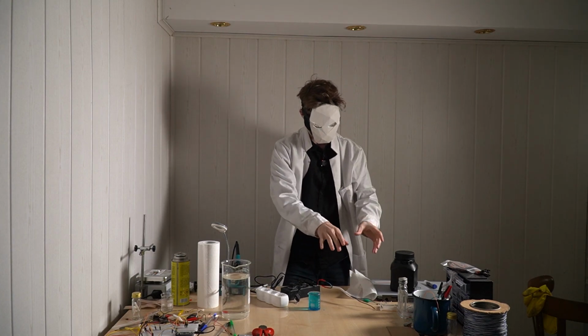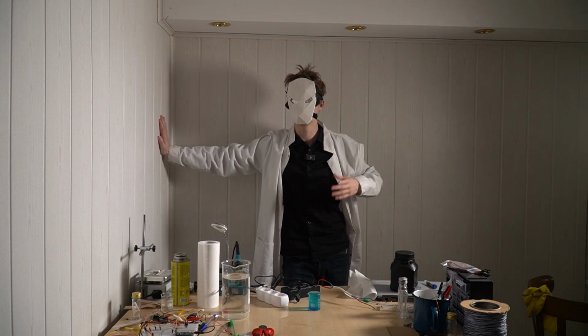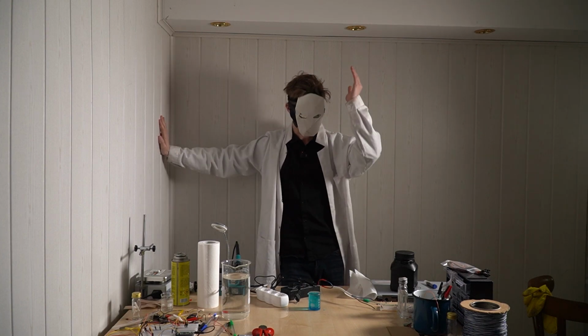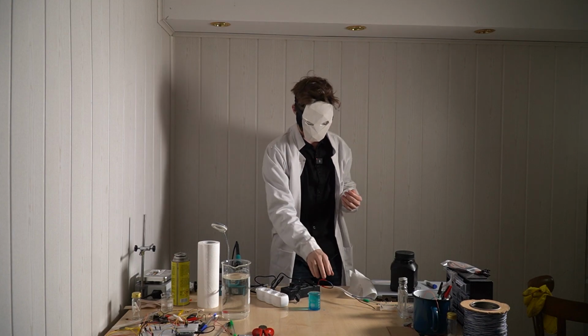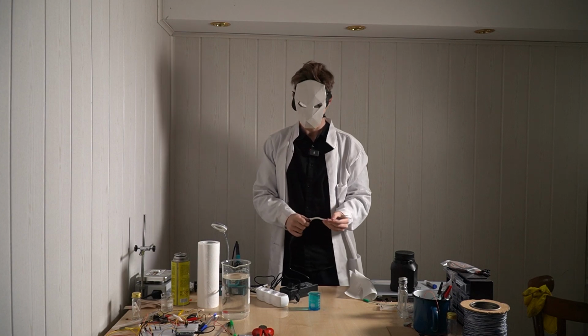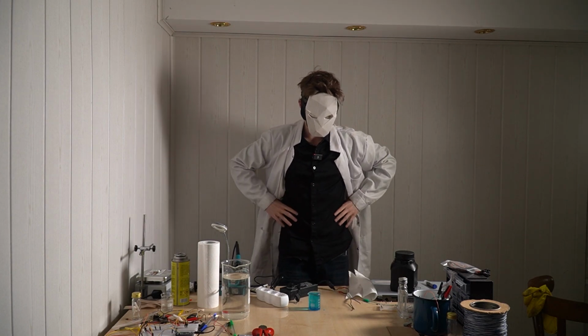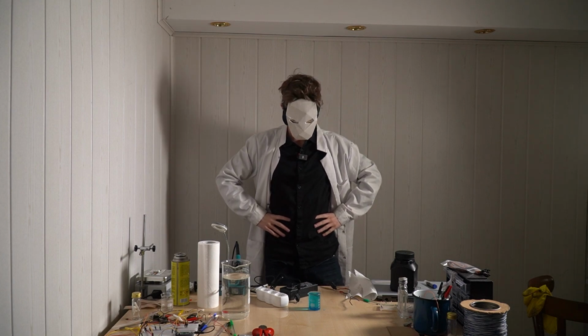There was like a weird thing forming on the cable too. What did I do wrong? I mean, I dropped some copper sulfate into water, and then I submerged two cables with electricity in them, and it should have worked, right? I mean, we did electrolysis. So what's wrong? This doesn't make any sense.